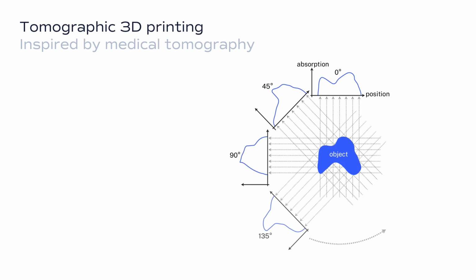The process used in Readily 3D's printers is tomographic printing, which is inspired by medical tomography. A medical CT scanner is a device which acquires X-ray pictures of patients at several rotation angles around them. A mathematical formula, called the radon transform, gives the relationship between the object and the projections, and allows to calculate one from the other. In a tomographic printer, this process is used in reverse.